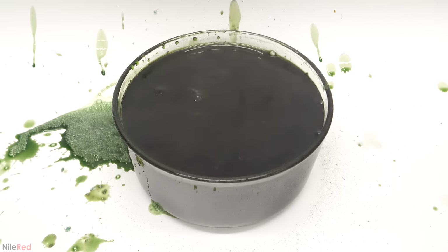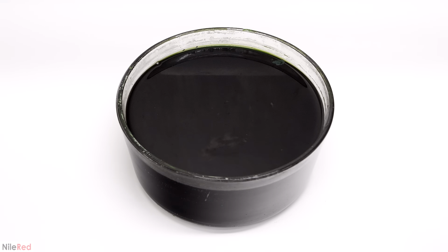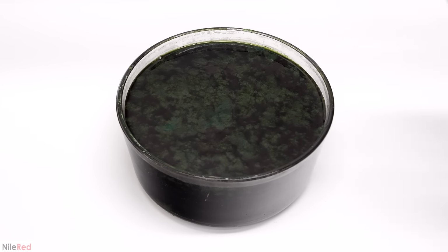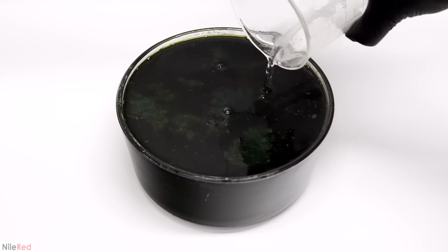cool down overnight. The next day, I tested the pH, and it was still slightly acidic, so I had to add some more hydroxide. As it had cooled though, some of the water had evaporated, and I could now go back to using a solution. This time, when I added it, a bunch of solid stuff came out, which was all chromium hydroxide.